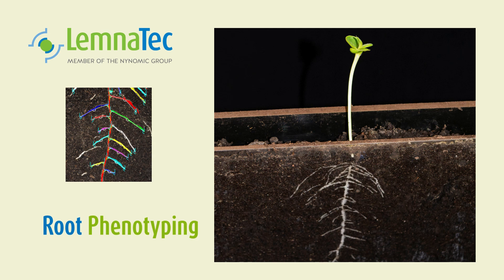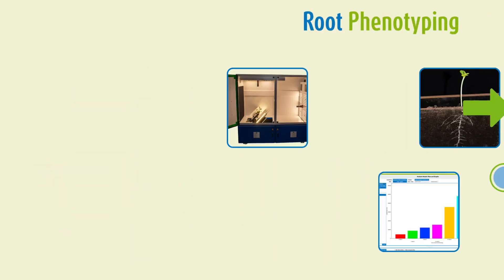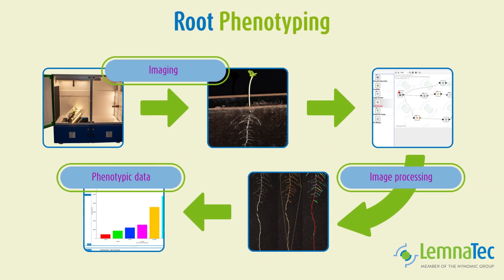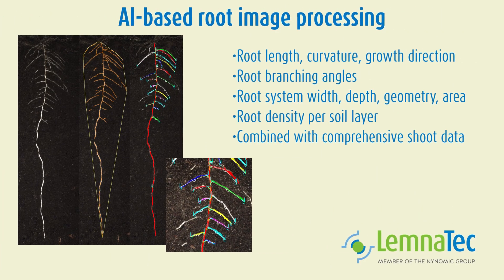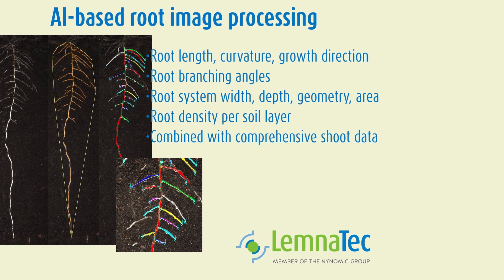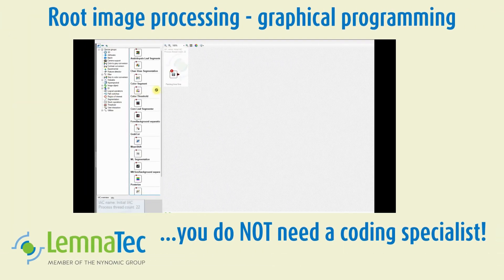Lemnatech root phenotyping. This video is about processing root images to get phenotypic data, starting with AI-based root image processing — that is, extracting phenotypic data from root images.